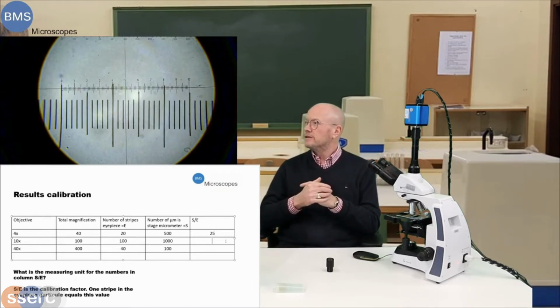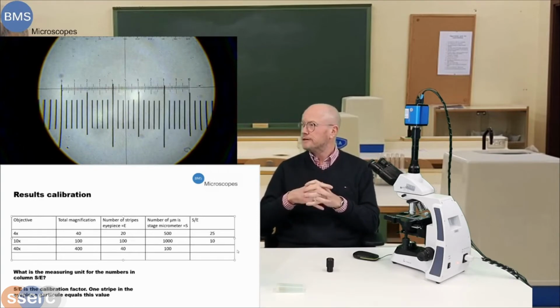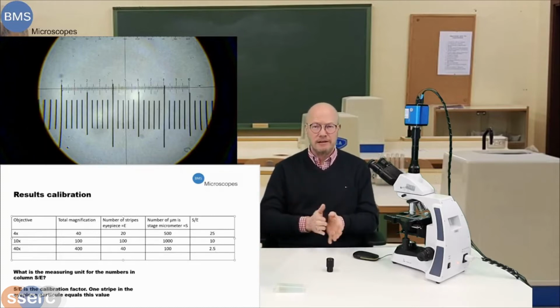Then on the 10 times objective it is 1000 divided by 100, which is 10. Then we get the 40 times, which is 100 divided by 40, equalling 2.5. These 3 factors are our calculating factors.